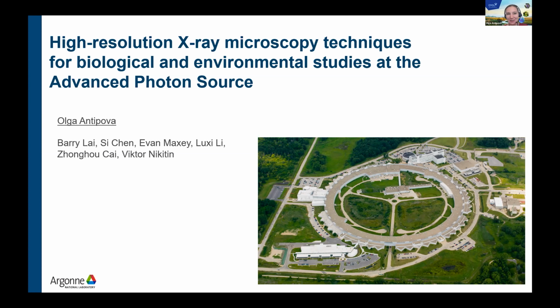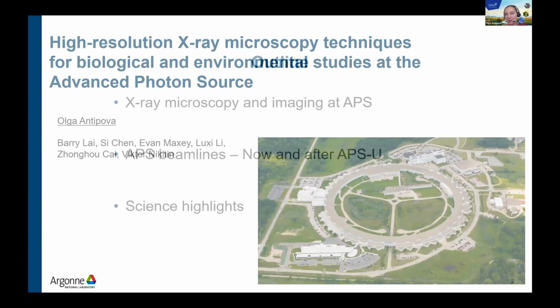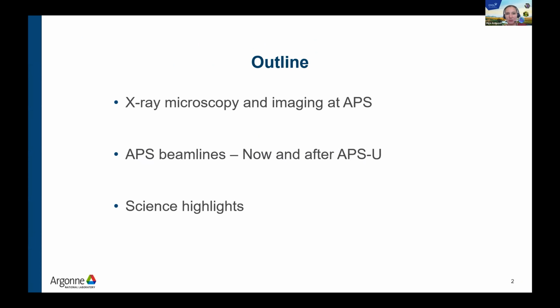Thank you for inviting me to give this talk. I know originally it was planned to be a little bit more high resolution than I can provide, but I think it'll be relevant for you. Today I will briefly introduce you to X-ray microscopy and imaging at APS, which is relevant to biological and environmental sciences, which beamlines conduct this research, and share a few science highlights with data generated at our beamlines.